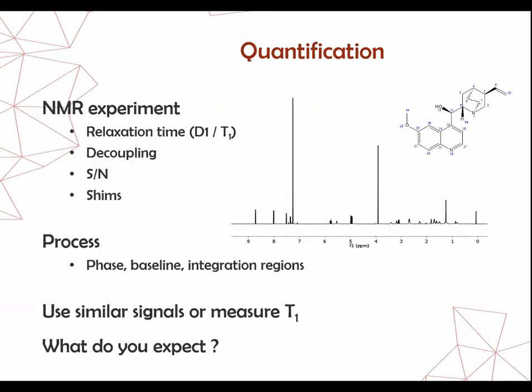Okay, so first of all, about proton spectra. I won't tell you much about usual proton spectra for just checking the compound, if it's clean, if you still have solvent. This is the most performed experiment on the sample changers. And sometimes people use the proton spectra to calculate reaction yields, for example.